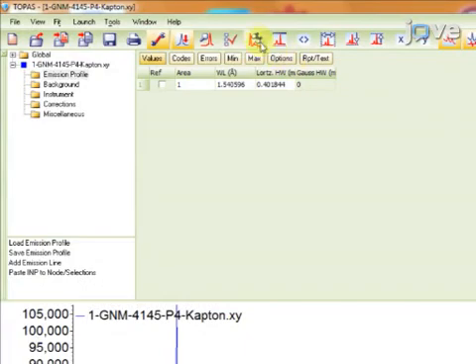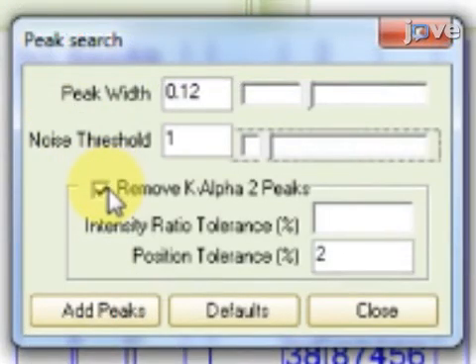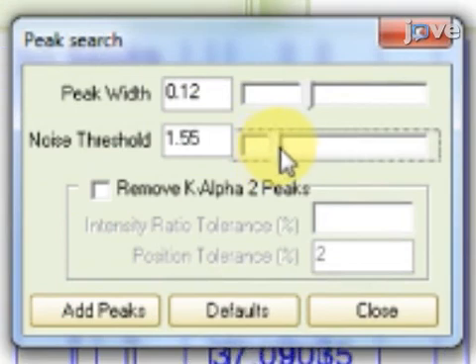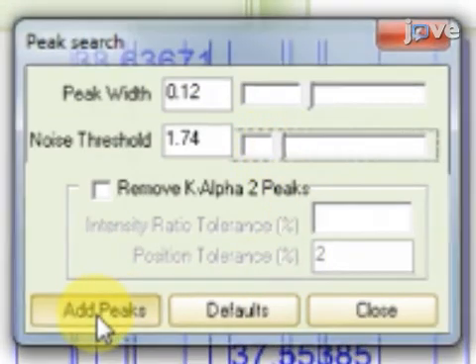Next, click the Automatically Insert Peaks button, and unclick Remove K Alpha 2 Peaks. After setting the peak width to 0.12, set the Noise Threshold to 1.74, and press the Add Peaks button.